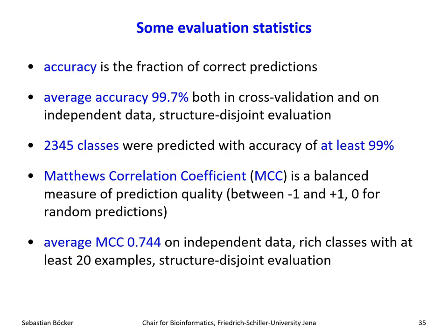So a much better way to measure that are coefficients such as the F1 coefficient, or even better, and that's what we use here, the Matthews correlation coefficient. It's a very nice measure for such a prediction quality because it's a balanced measure. That is, it's always between -1 and +1. It's always 0 for random prediction. So if you randomly say yes or no, you will always get 0 as a Matthews correlation coefficient. It's always +1 for the perfect prediction, and it's always -1 for the anti-perfect prediction. So somebody deliberately saying the wrong thing all the time.